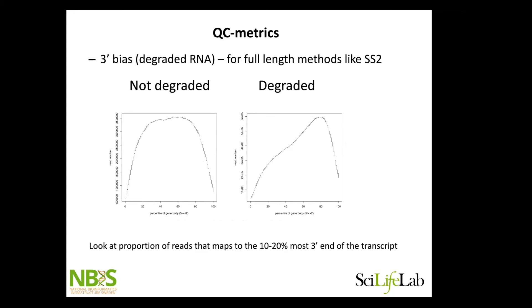For full-length methods, we can look at coverage across the genes. With good quality RNA, you should have coverage all over the gene. But if you get RNA fragmentation and capture the poly-A tail, you will get a strong 3-prime bias because you'll mainly sequence the 3-prime end of transcripts. For Smart-seq2, I always look at this, and cells that show strong 3-prime bias I would probably discard.